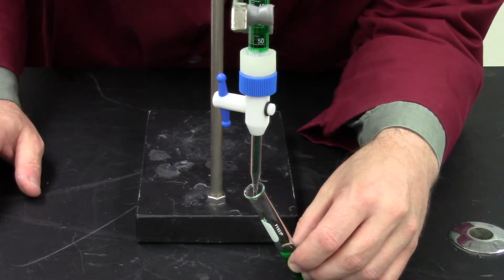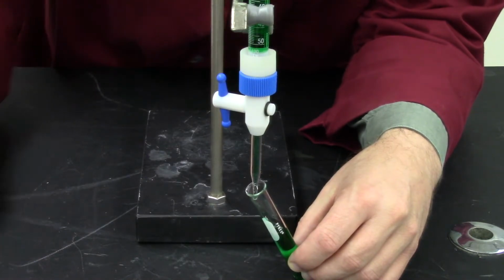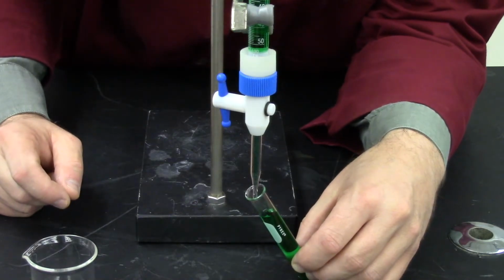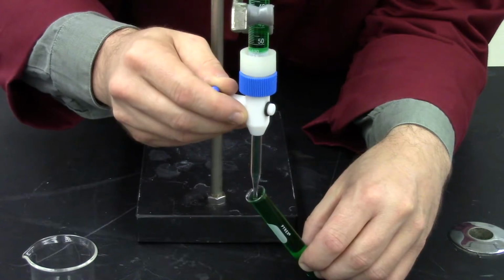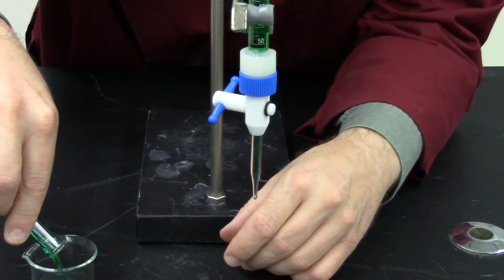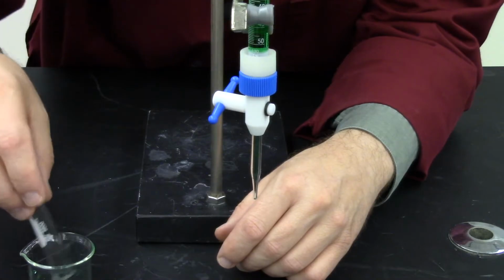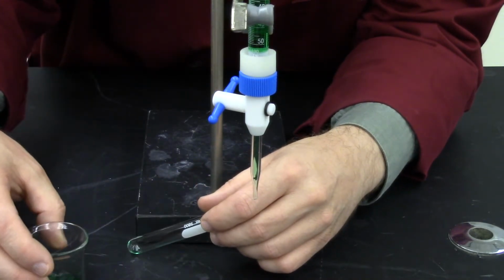And instead of pouring this water into a graduated cylinder, I'm going to pour this water into a 50 milliliter beaker that I have right here. I'll show you the meniscus of both in a moment. There we go. And now pour this water into the beaker. There we go.